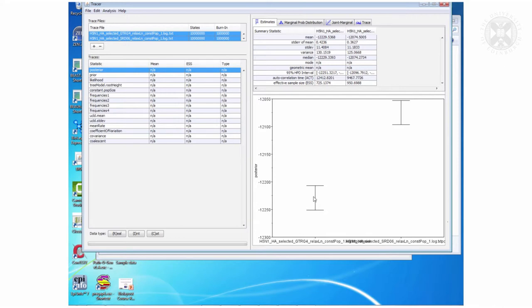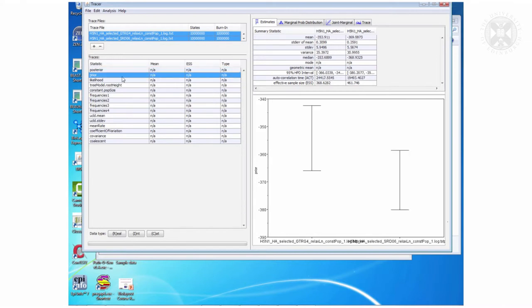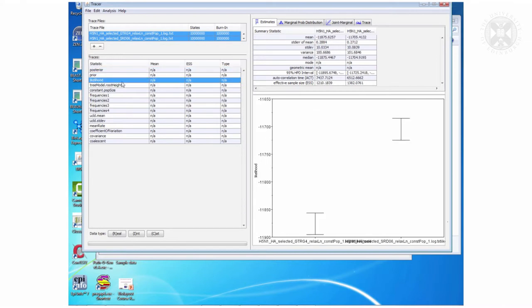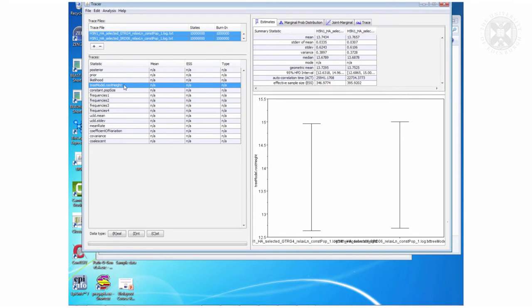So this is the first file the GTR this is the second one the SRD06 comparing the posteriors the priors the likelihoods but then when you look at the root height actually if you look carefully mostly these are about the same.